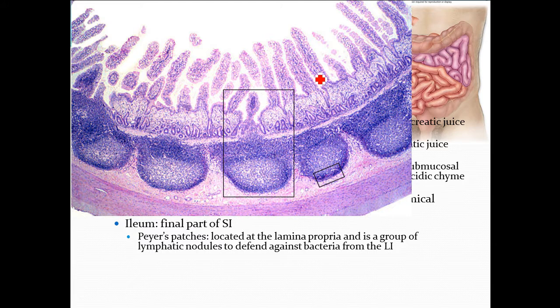If you were to zoom up on one of these things here, what is this structure that you have here? This is a villus. Yeah, a villus. A circular fold, if you do see one, will be like an extension of this, and then you have the villus coming off of it.